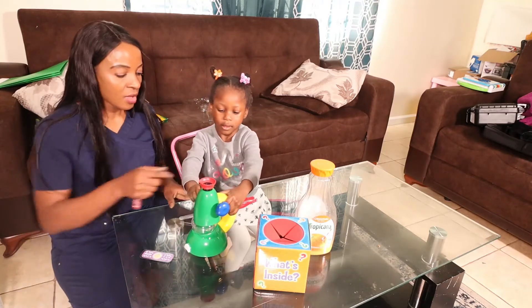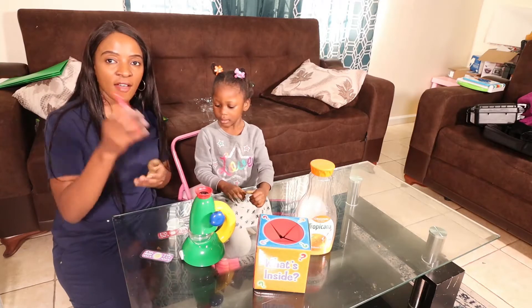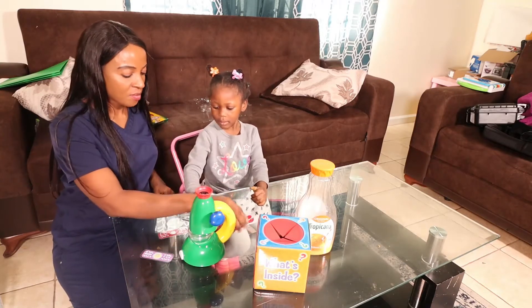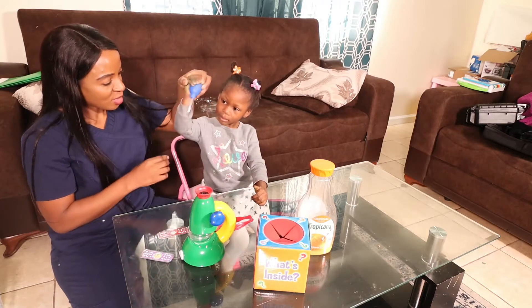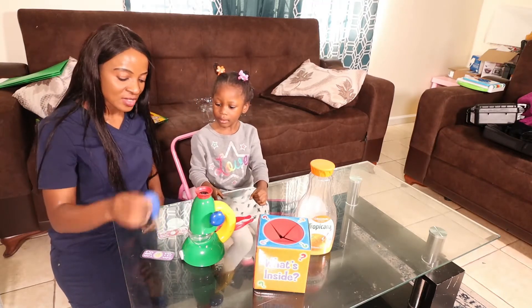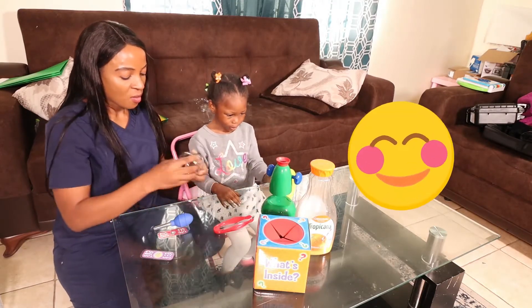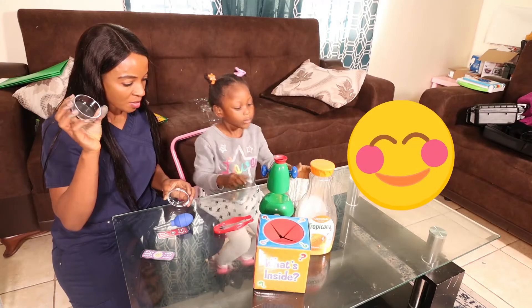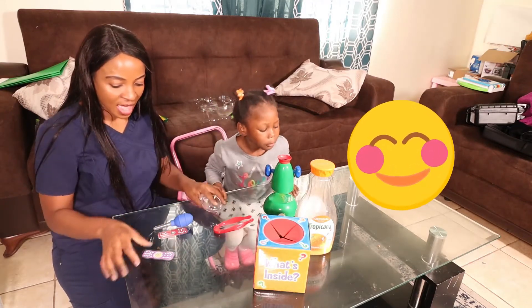I'm looking through the manual just to see the materials that come with the box. We are going to use a tweezer to pick up objects, a dropper, and hand-over-hand technique for Amira to drop the specimen in the petri dish. We have our petri dish, which we are going to use for the science experiment.